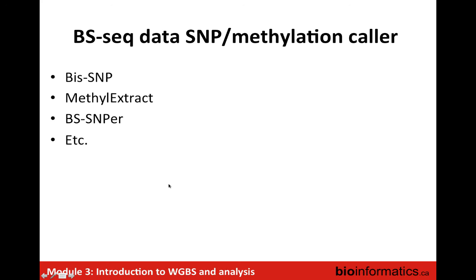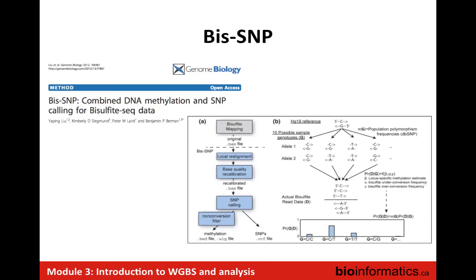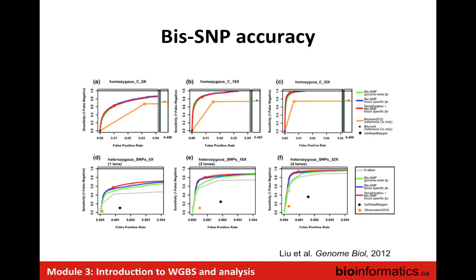Okay, so we're coming towards the end, and this was, as I promised, the most challenging and maybe scariest part. Again, there's ways around it, and there's information that can be extracted, but if you thought Bismark was a challenge, this is even more so when you're trying to extract the information on both strands in that way to detect potential SNPs and allelic effects. So again, there are some tools that systematically pull out that information and use the trick that I talked about of using both strands. And there's benchmarking on the accuracy. But again, for this to work, you need higher coverage. This is what this is showing a little bit. So you need higher coverage to be able to really extract that information efficiently.